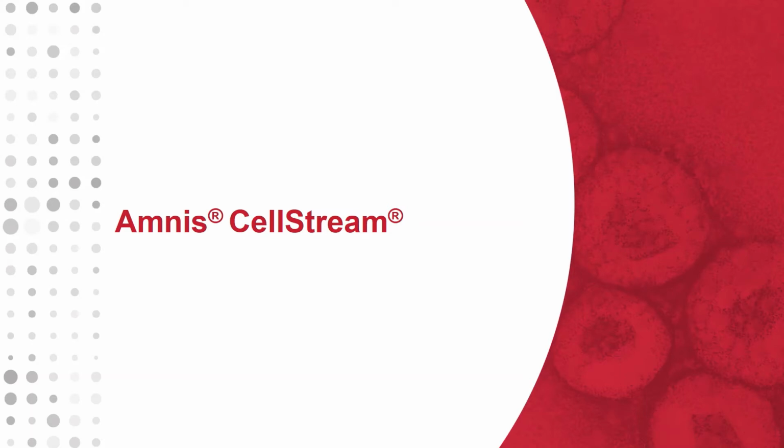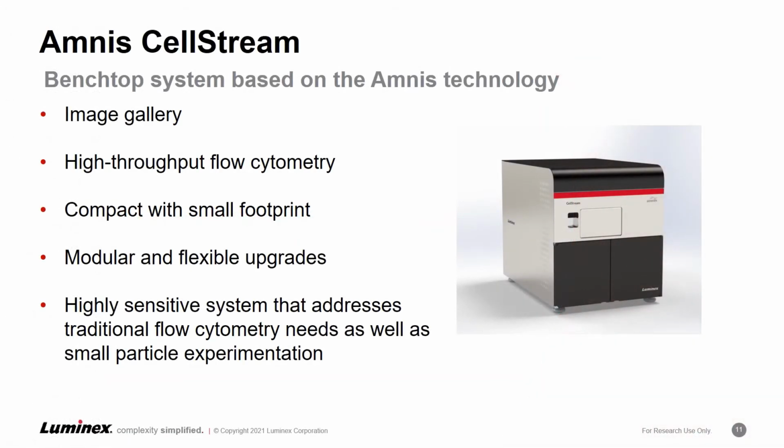Next, we'll talk about the Amnis CellStream, a camera-based flow cytometer which uses time delay integration (CCD) technology. The CellStream system is a benchtop camera-based flow cytometer built on the Amnis technology similar to the ImageStream. An image gallery is used to visualize objects in flow.